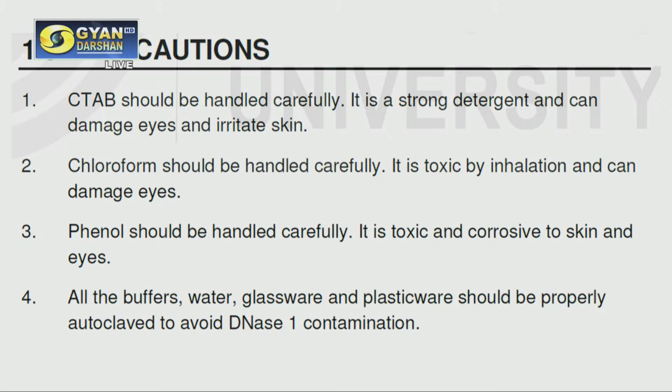All the buffers, water, glassware, and plasticware, as I have already mentioned, should be properly autoclaved. They should be sterile. Otherwise, if there is DNase contamination, then your entire DNA will be fragmented, and you will not get the intact band. So the autoclave part is very important, and you have to maintain the sterile condition of all the reagents, buffers, chemicals, and the glassware and plasticware.